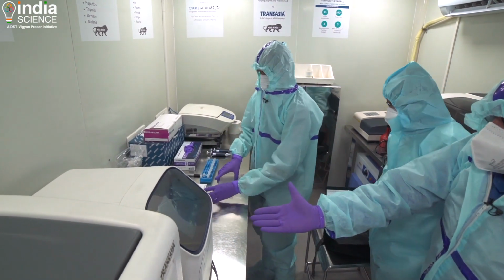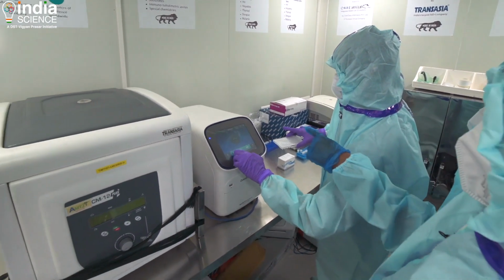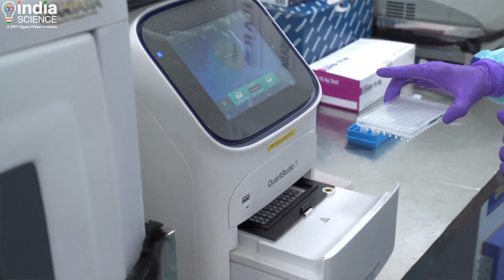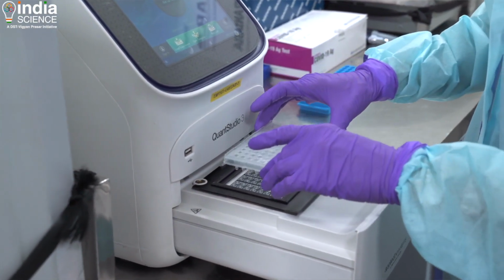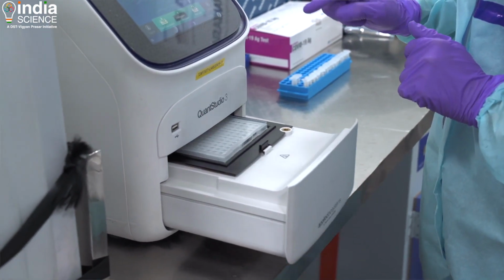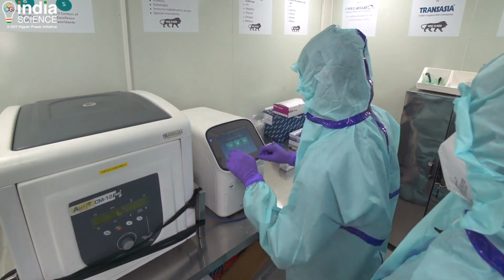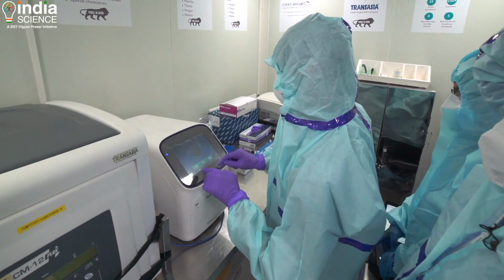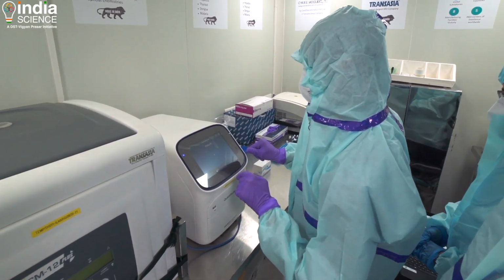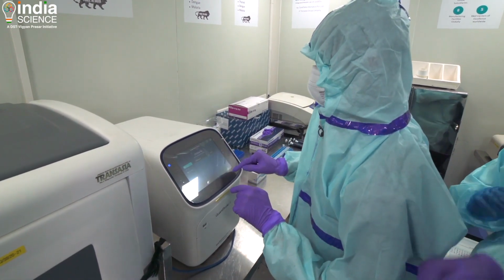This is the RT-PCR machine. How do you load it? Yes, this is the RT-PCR machine, and once we set up the reaction, it's kept in here, and it goes in. And we start the experiment. So this is how we start. You set up the reaction and you start your RT-PCR.